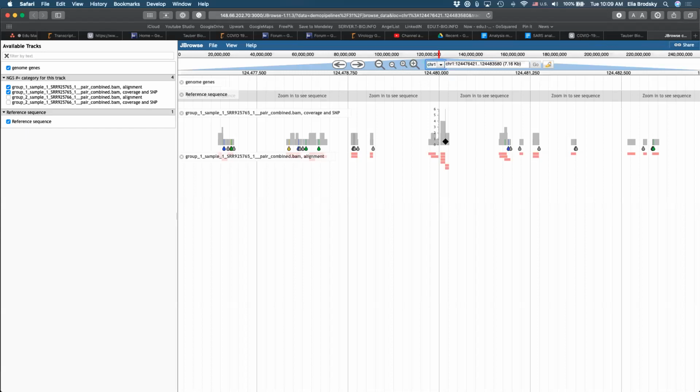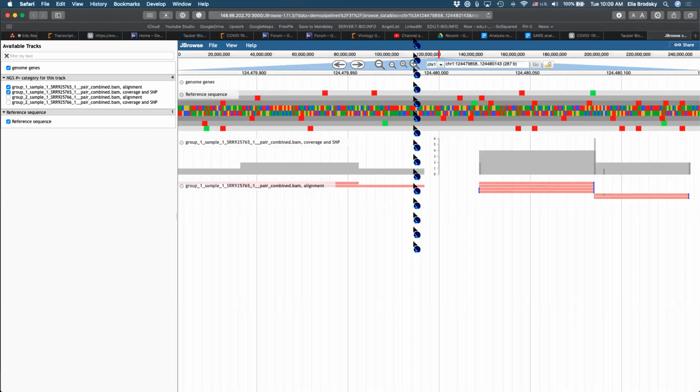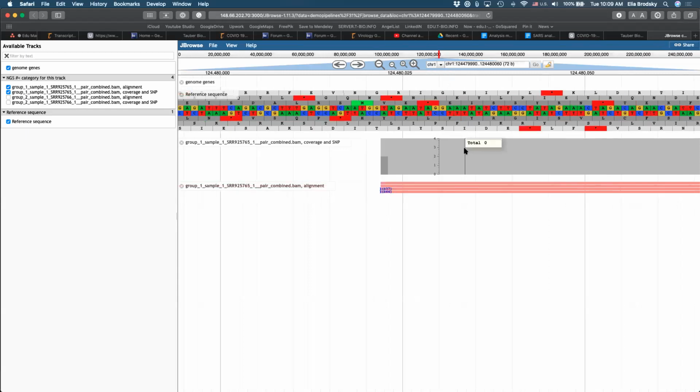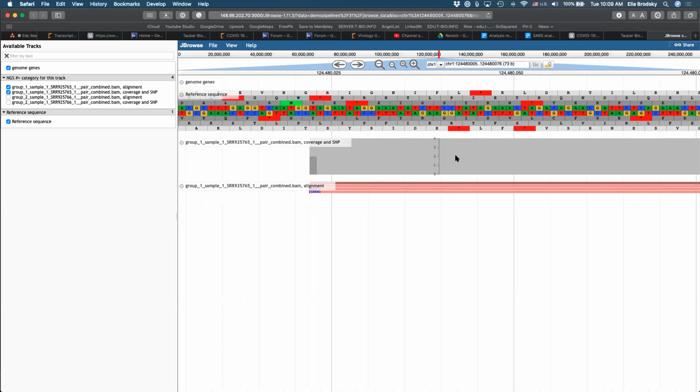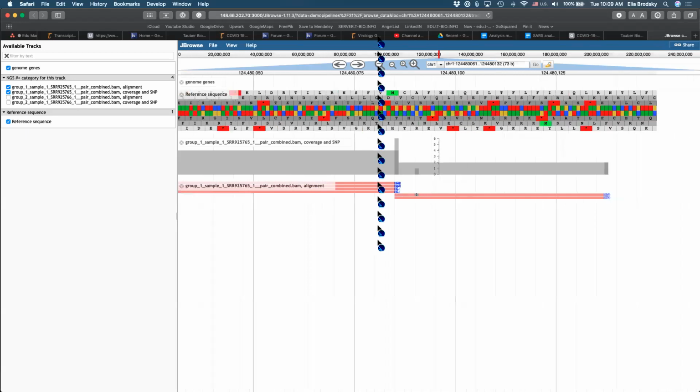And if you zoom in, I wanted to zoom in and just show you that you can actually see the sequence, right? So continue zooming in. Here's the sequence, right? We have the two directions of strands, and then we have the frames that convert it to amino acids. And then we have the actual data. So our data is right here. These are the reads. And this is the reference genome, right? So now let's zoom out.